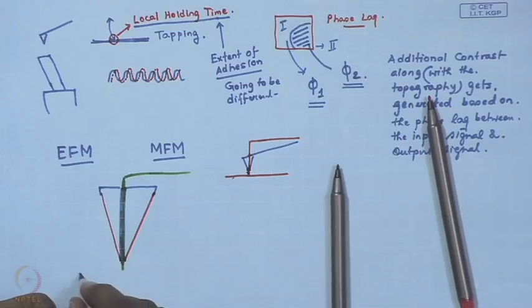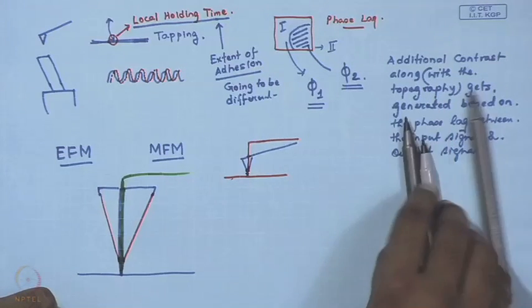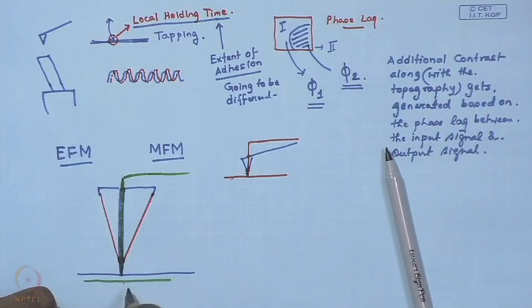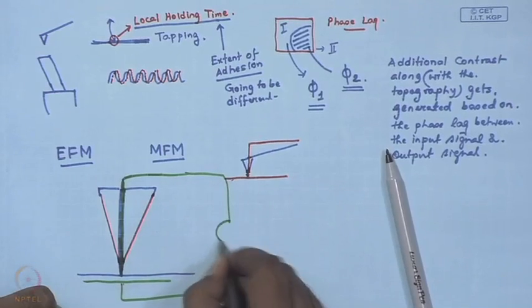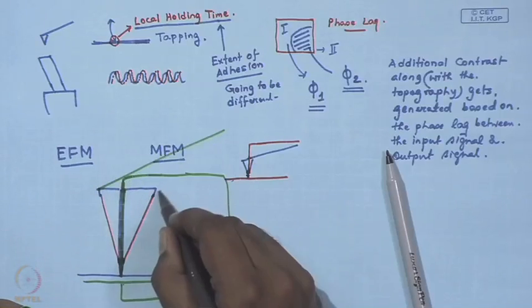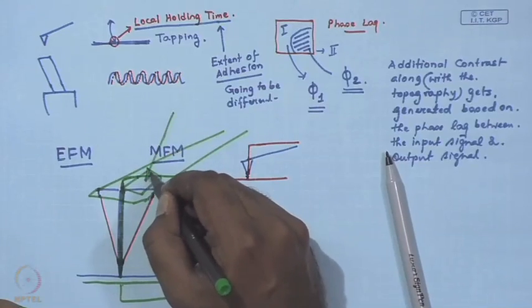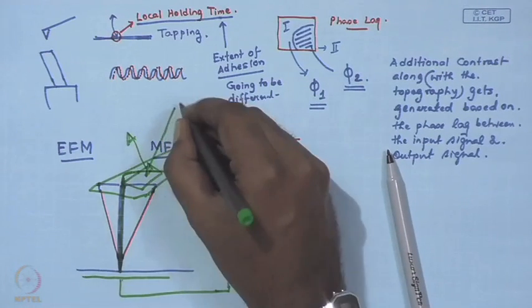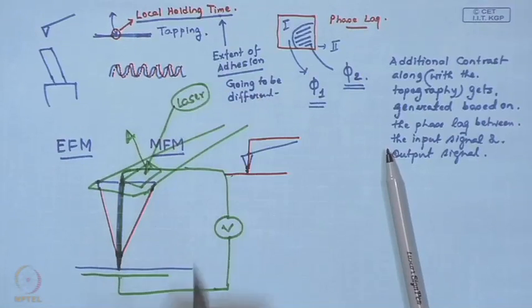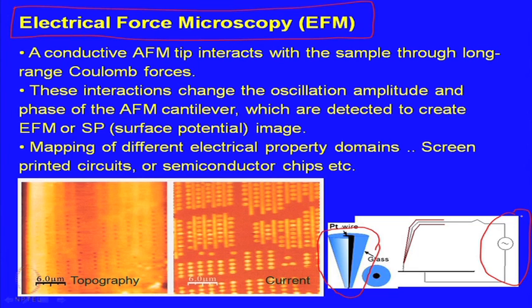And this is the surface. As it approaches, the wire physically comes in contact with the surface. The surface has to be a conducting surface, and you complete a circuit by applying a voltage or a bias from outside. So, in addition to the beam bounce probe, where the laser is operational like a standard AFM, you additionally have an electrical circuit which supplies the bias.